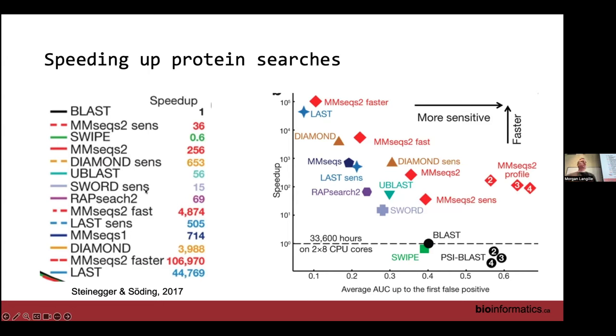their options. So you can have MMseqs where it's sensitive, trading off more sensitivity for speed, all the way up to faster. And you can see, obviously, the huge speed-up that can occur with some of these algorithms. If we did BLAST, this would be a one. You've probably heard of DIAMOND. It's very popular, and that's already 4,000 times faster than a BLASTX search. So you can imagine that's going to find things a lot faster.